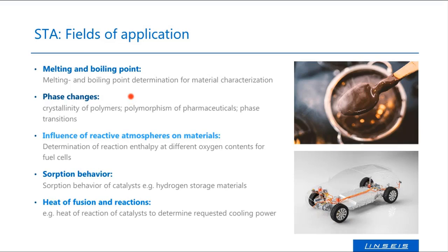Of course, you can use it as a DSC. So what's classic is the melting and boiling point determination, phase transitions, like glass transition, polymorphism of pharmaceuticals, and so on. This is something the DSC does.